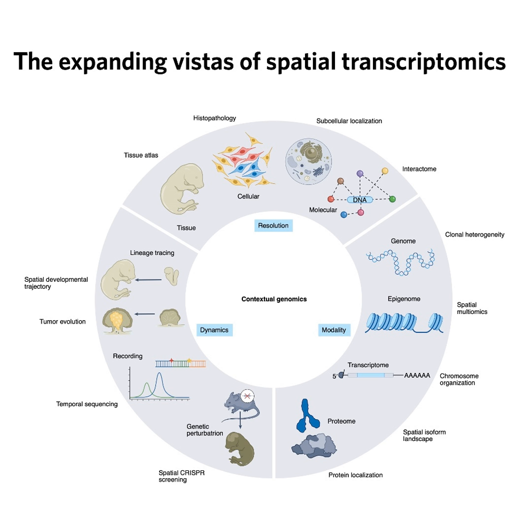So what are researchers suggesting? How do you standardize this? Do we need reference points? Yes, exactly. We need widely adopted reference tissues that have known, reliable, and complex enough histology that everyone can use them as a benchmark. What kind of tissues work for that?